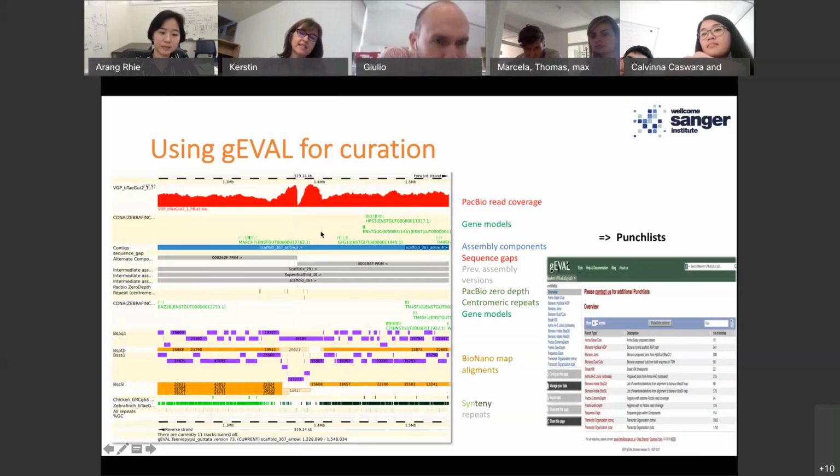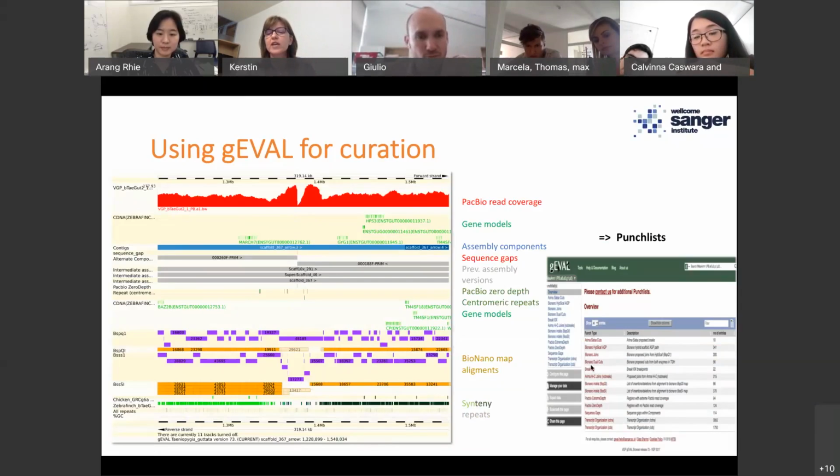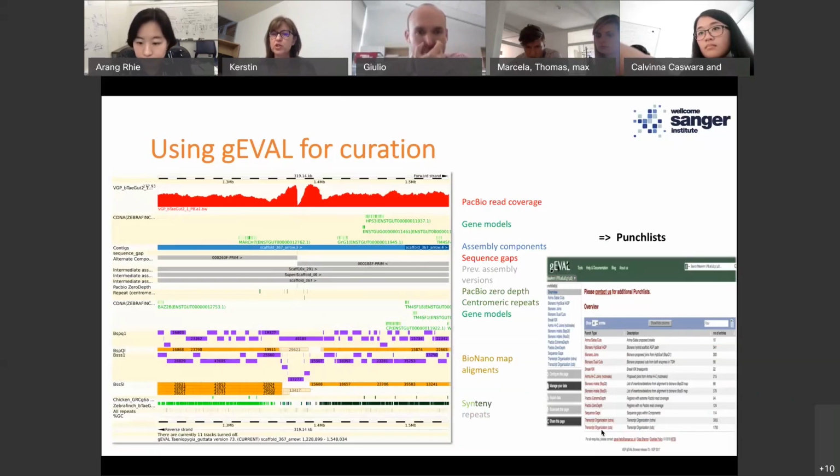We don't, as I already said, just get our information from the browser interface, but also from the punch list, and more or less bespoke for every assembly. So we can list here, for instance, everything that break10x tells us, everything that the BioNano script tells us should be broken or rejoined. We can look at other weird artifacts like zero depth regions from PacBio, extreme depth regions. We look at transcript organization. So for instance, one half of a map or an aligned transcript is here, the other half is there, this should be joined, etc., etc.